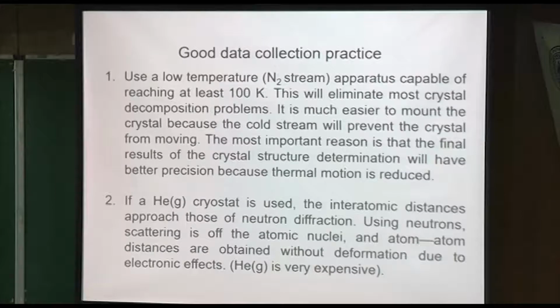Okay, so the results are going to be better. You're going to get more data. Thermal motion cuts off the high angle scattering so that you get less data, and that, of course, affects your precision.